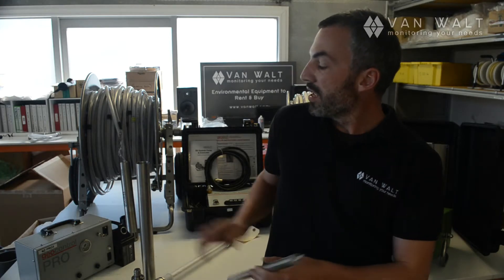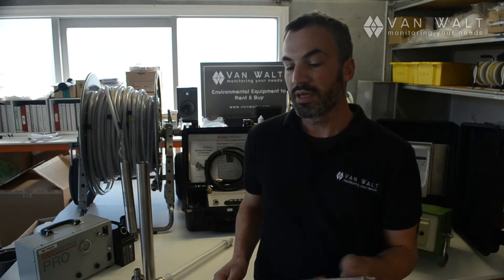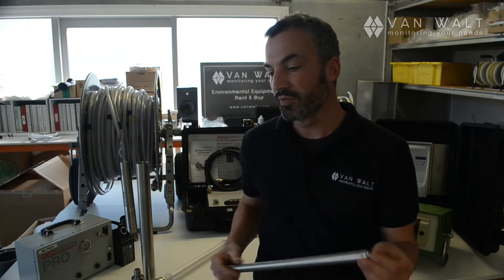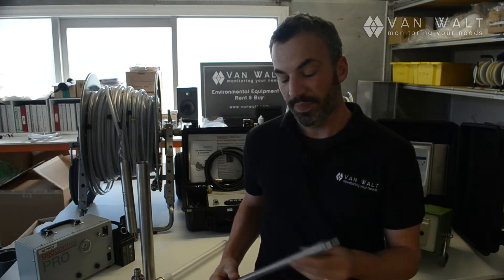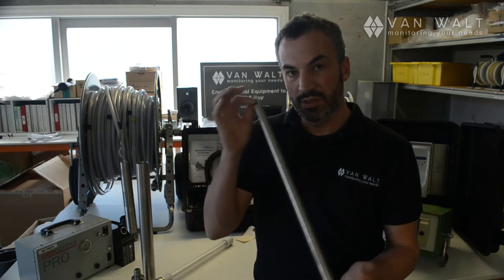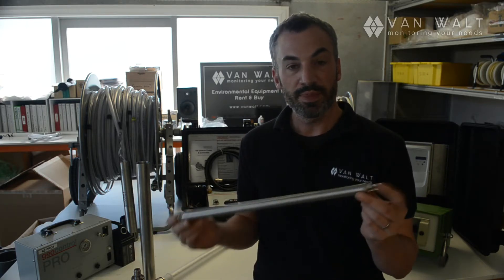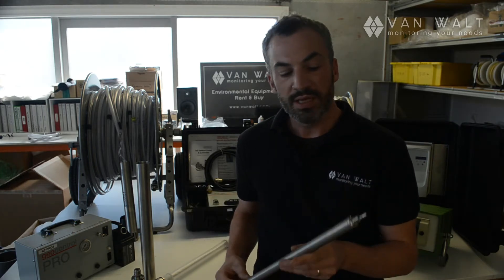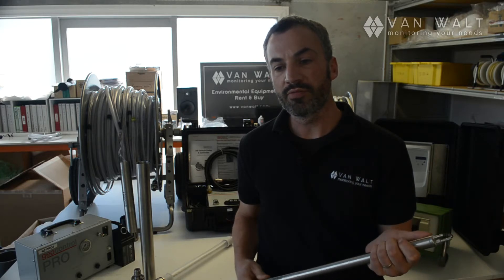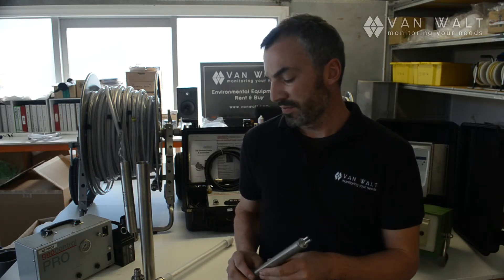So no VOC losses, but quite an awkward pump to use. If you're trying to repeat sampling with different staff using this pump, results have the potential to be variable because of how tricky it is to use — though it gets easier once you're used to it. As far as dedicating pumps to a well, that is possible — you could leave it at the bottom of a well with the tubing, which makes sampling easier, but it is an expense. If you did that, you may consider using a Teflon bladder and/or Teflon tubing to extend the life of the plastic. However, if you're looking at PFAS sampling, that is not going to be an option.